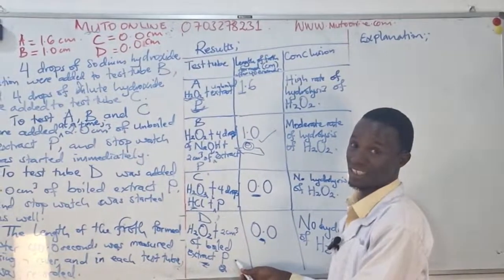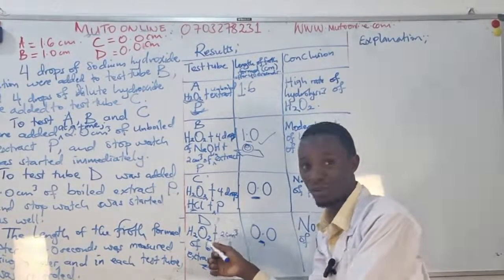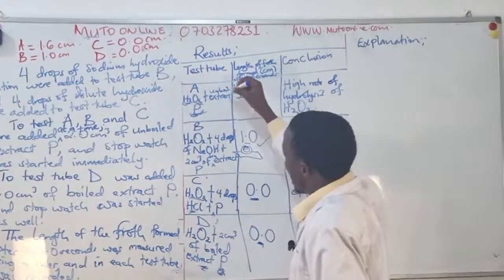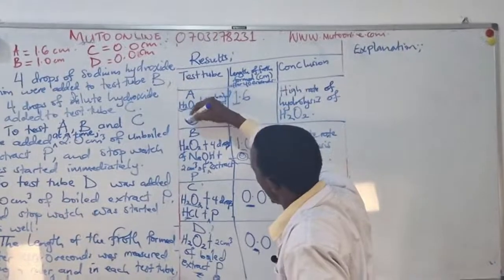I think we can see this. We were using the room temperature, we did not incubate. And still, P must be provided a neutral pH.